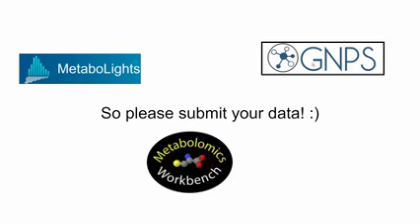But please keep in mind, the only reason these things work is because people upload their raw data and metadata to different places, which then allows you to do this kind of analysis, us to do this kind of analysis, you to look at your own data from a different angle, because you can very often make different findings when you use these kinds of tools and put your data in context with other public data than when you look at your own data just with your in-house tools. You will just typically, as I think we all know, use maybe 1% of your raw data, and the rest will just get kicked out because you can't really make sense of it in metabolomics. And this will allow you to get a different angle, and also the whole community to grow with that. That's basically the idea.